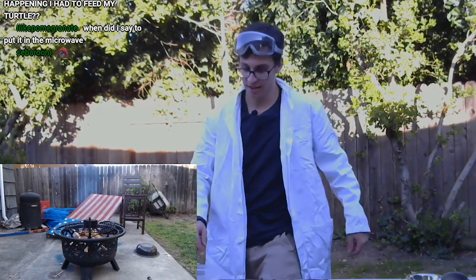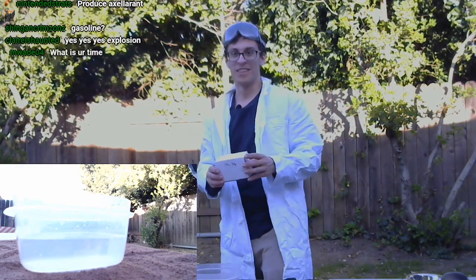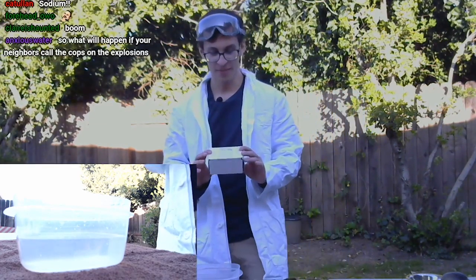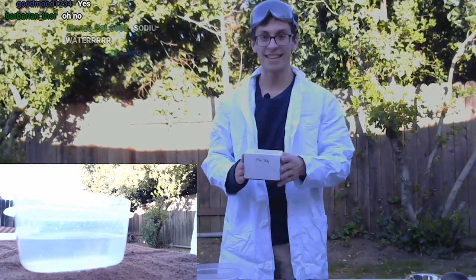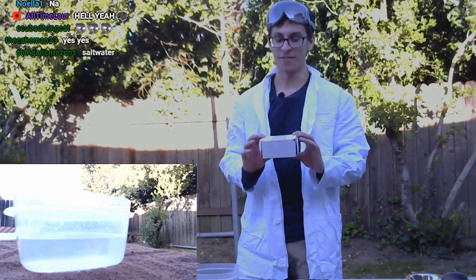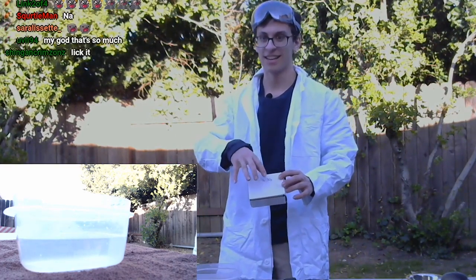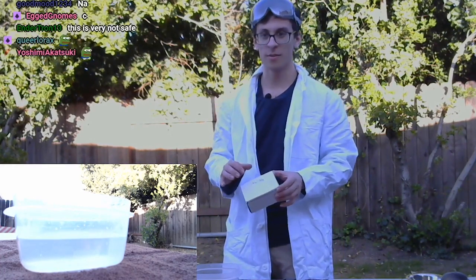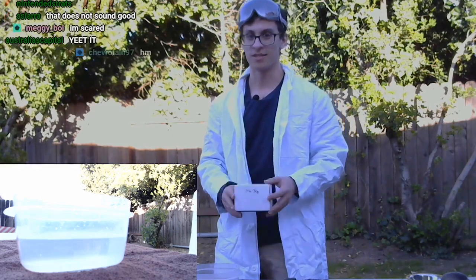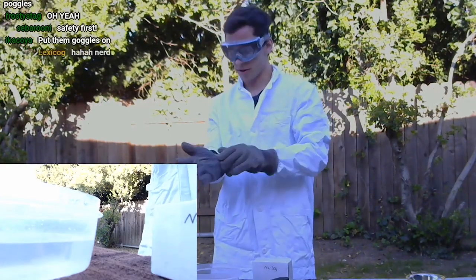So you guys want to explode some things? This right here is 30 grams of pure sodium. If you guys know what pure sodium is, it's violently reactive with water. I've opened this and it's all covered in oil so no water can get inside. We're going to be very careful and deal with this. Does the oil protect from oxygen also, not only water? Yes — we don't want it to oxidize as well. Safety first, guys. Safety's cool.